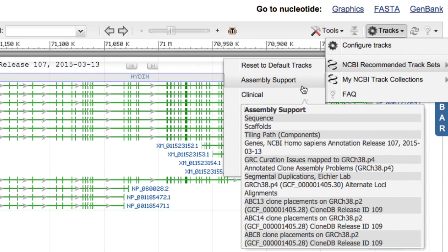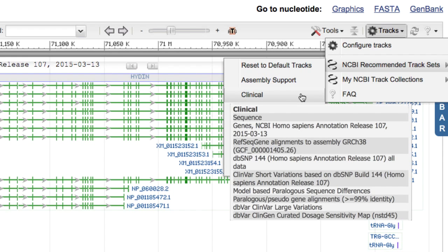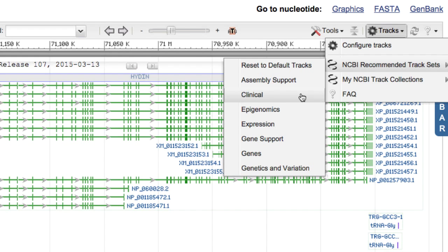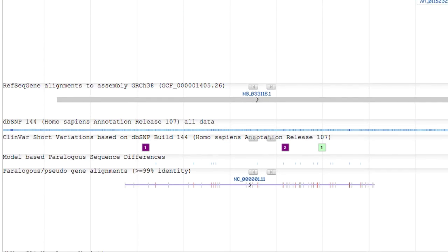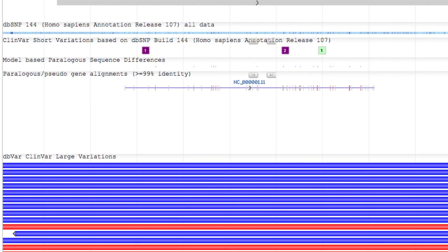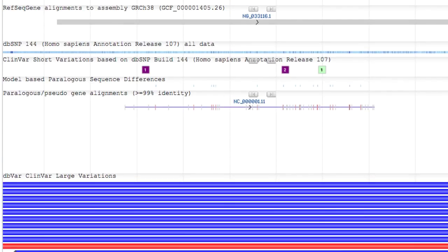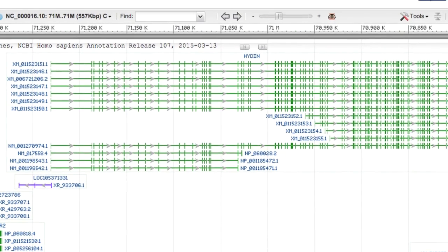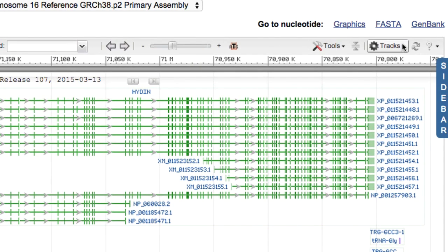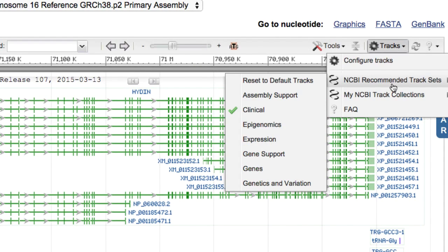For example, if you are interested in HYDIN for clinical diagnostic reasons, you can click on the Clinical Track Set. The graphical display updates, replacing some of the existing annotation and expression tracks with tracks useful for interpreting variation data and putting it in a clinical context. In the Tracks menu, a checkmark appears next to the selected track set.